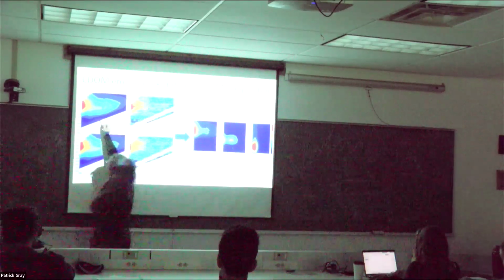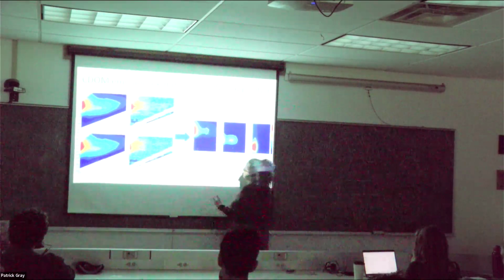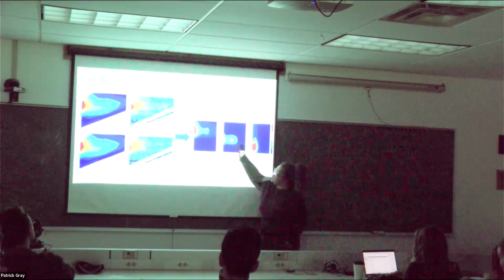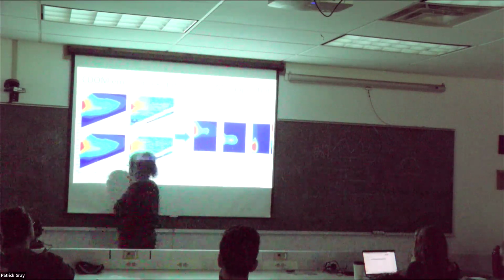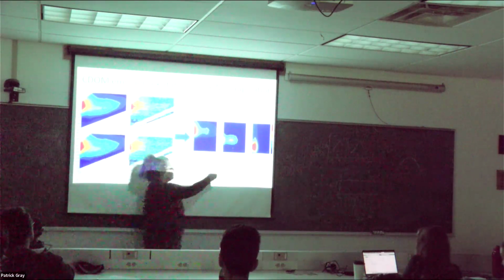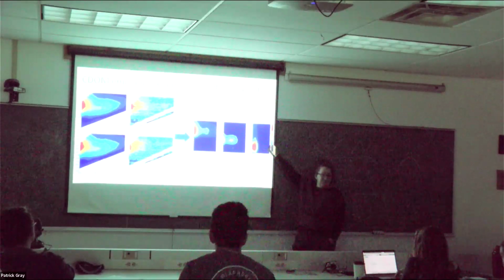So this big peak here probably is coming from some kind of riverine plume or something. This is really specific for some terrestrial humic acids. This is marine humic acid, so probably, going 307, 375, somewhere here we're going to find marine humic-type acids. These are protein-like, probably zooplankton decomposing or phytoplankton oozing or something like that, no?